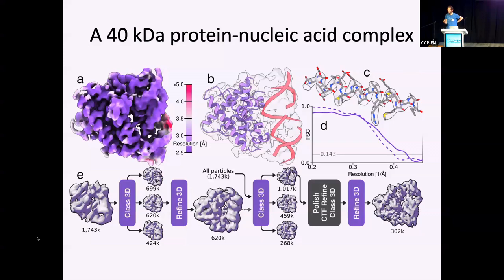He was unable to solve this for about half a year or so using CryoSPARC or RELION. He was completely stuck. Then he sent the data to Dari, saying perhaps you can do something with it with Blush. Dari went through a relatively straightforward procedure where you use Blush both in 3D classification and in refinement, and came up in the end with a 2.6 or 2.7 angstrom map, which we used ModelAngelo to automatically build most of the model. We sent this to Max, only the map, because we knew Max really loves model building, so we kept the model at home. Okay.